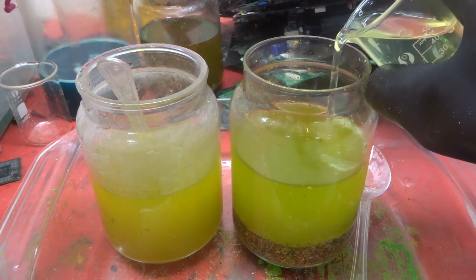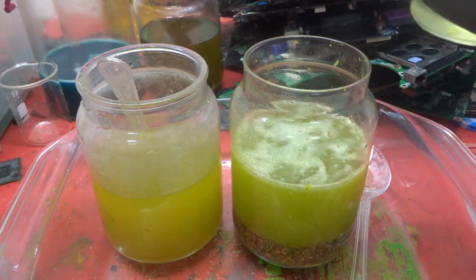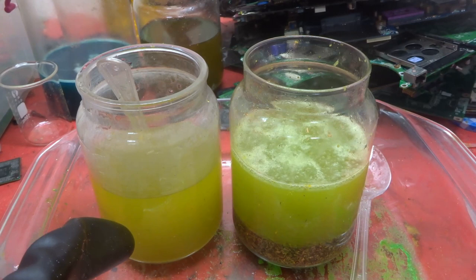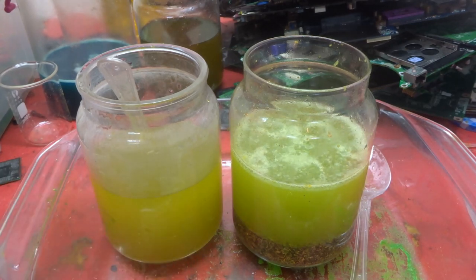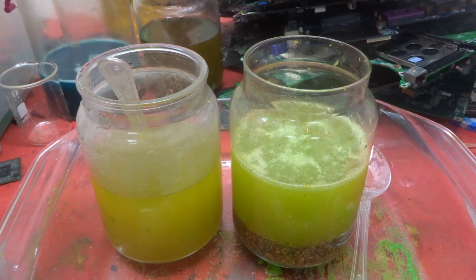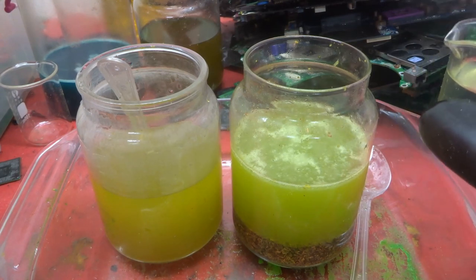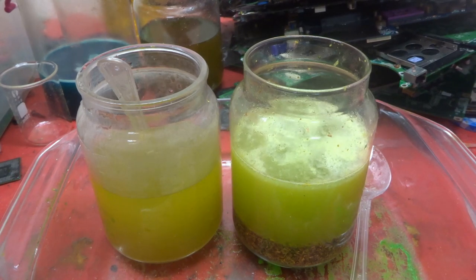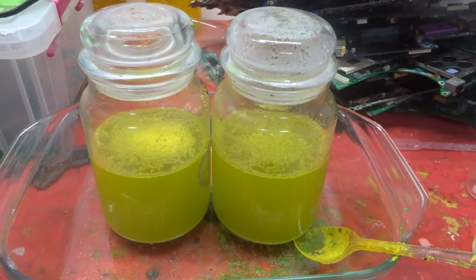I'll add a little more bleach and let it start to work on the flakes. Then I'm going to siphon off one side, add fresh HCl, add more flakes and more bleach, and check back in 36 hours. I'm going to have a lot of solution to deal with because I probably put too many flakes in, but we'll check back and see whether we still have a lot of flakes or whether we're better off switching to nitric.